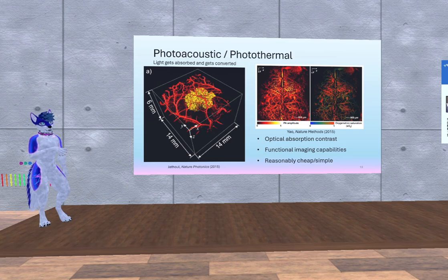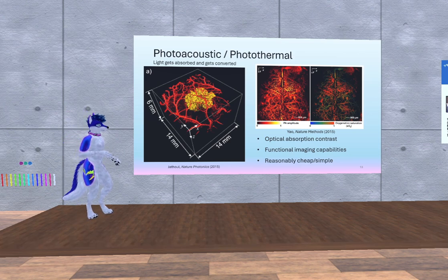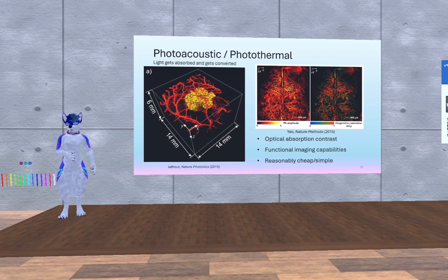So normally in photoacoustics, you send in a pulse of light, and that pulse of light gets absorbed by the chromophores that you're targeting, and some chromophores that you're not targeting, but we won't worry about that right now. If you do that with a fast enough pulse, you get a thermal rise, a pressure rise, and then that can send out acoustic waves. Generally this is done with acoustic transducers. A very common system would be a big nanosecond pulsed laser and an ultrasound detection array, though that's not really the best thing for it. But most of these images are taken with something like that.